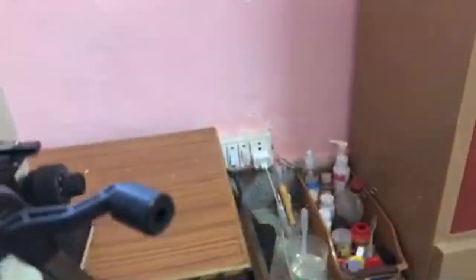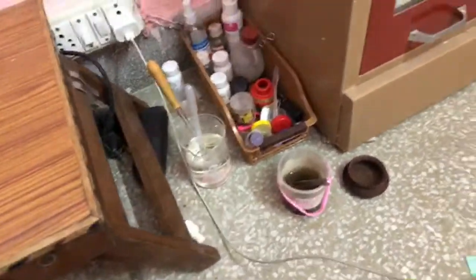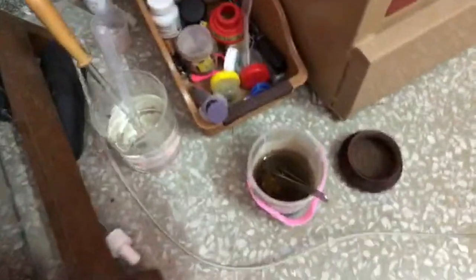Okay. So, friends, what I was doing was I just had this water sample lying on the table for a few days, and I'd been enriching it with a little bit of things like grains of rice and similar stuff. And today I found a dead dipteran larva on it. So I put it on the slide, and now what I see is that there is a party for various microorganisms on it, and especially I was fascinated to find a lot of amoeba in that. So I'll just share that slide with you.